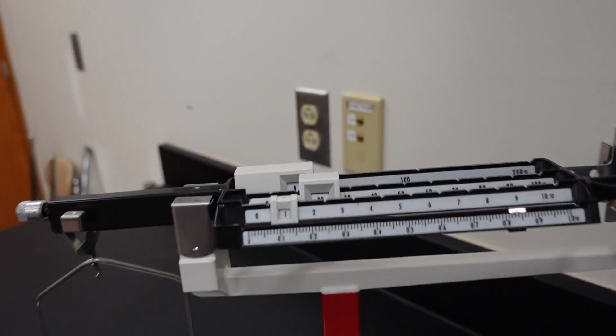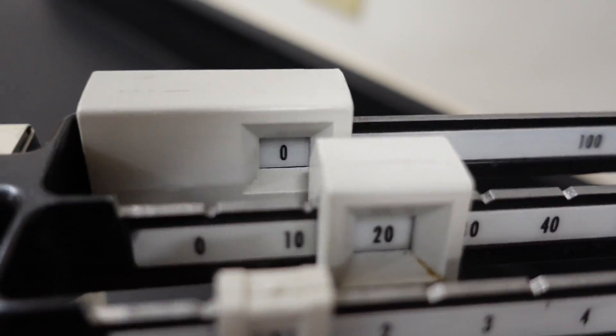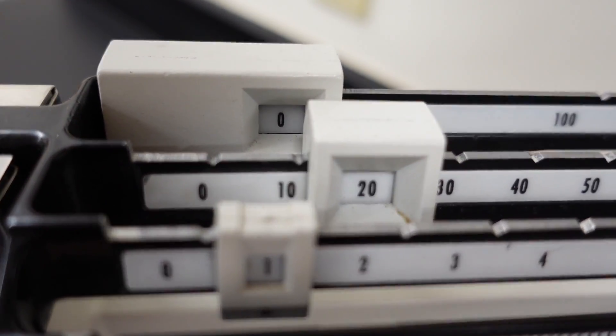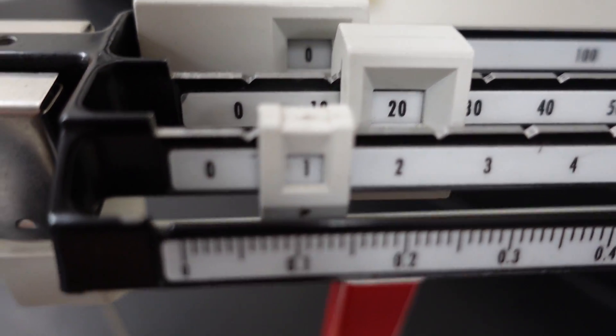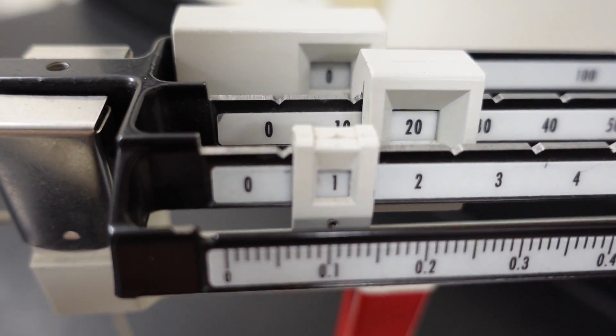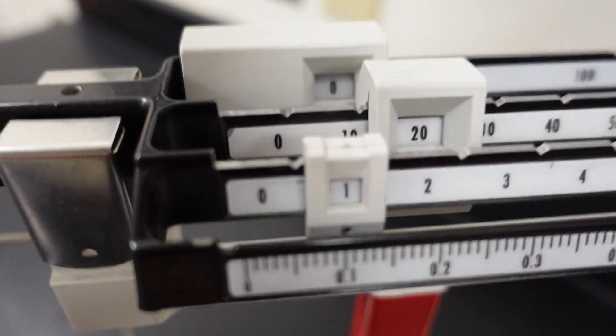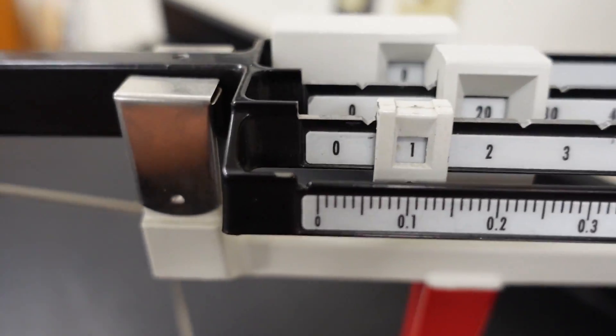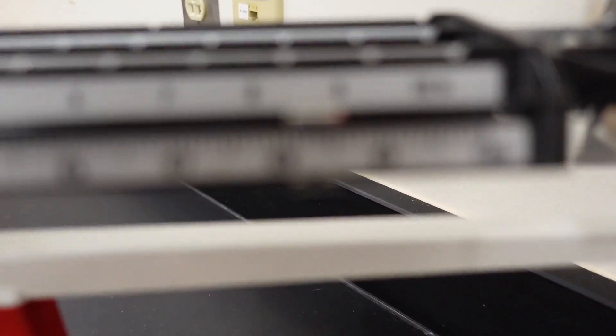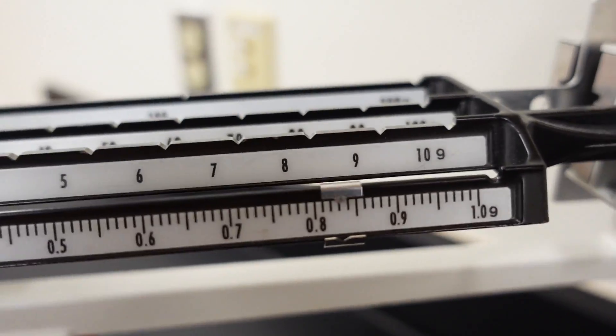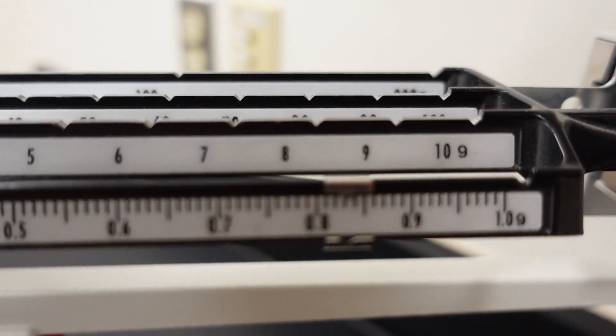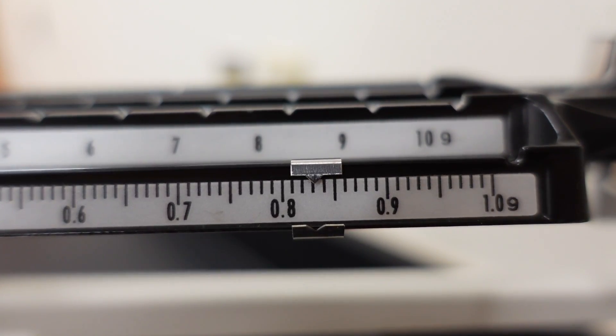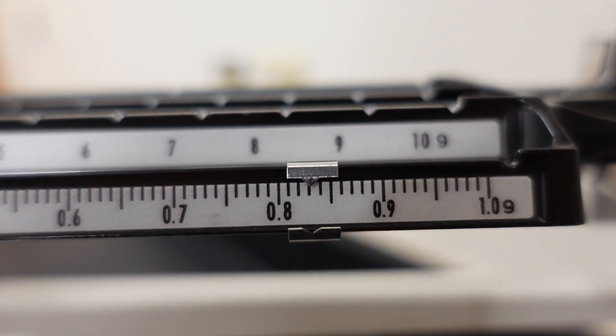Now, let's take a look at what our mass is. Here is the mass. That is the hundreds place. There is the tens place. There is the ones place. Now, where you're going to need to focus your effort. You have that. The tens and the ones place. Where you're going to need to focus your effort is in the last three places. So, go ahead and record that.